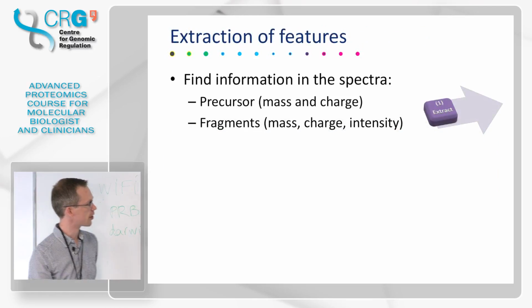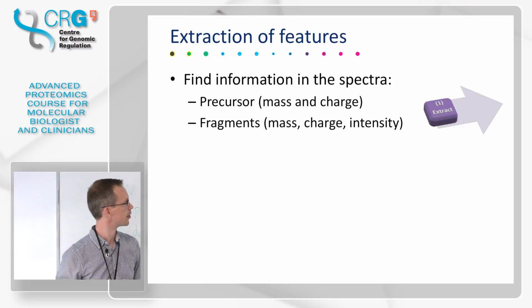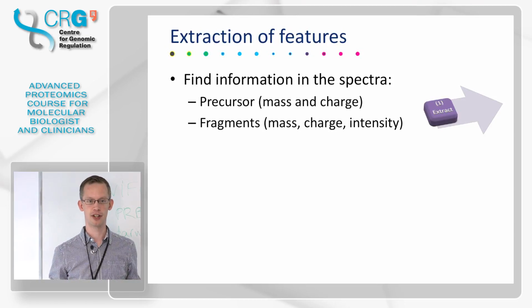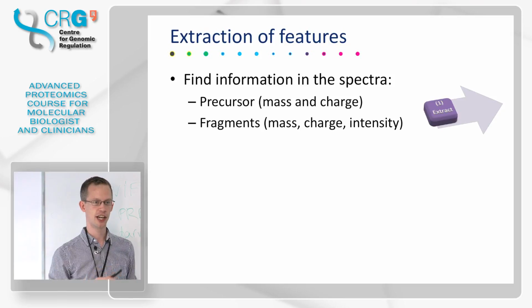So let's look at this extraction step. Now we want to extract features, that's what I term it anyway. Essentially this is two things. It's finding the precursor information: what is the mass of the intact peptide, and what is the charge? And what are all the fragments that these generate? That's the mass, charge, and intensity.